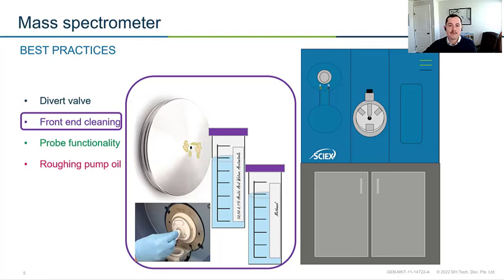You come into the lab, you take off the source, and you can take off that curtain plate all without venting your instrument at all. So just disconnect your hardware profile, take off that curtain plate, and give it a quick wipe down with a Kim wipe. Take a Kim wipe with some water, you can add a little bit of acetic acid and some acetonitrile, and wipe off any sort of particulates that have built up on your curtain plate.